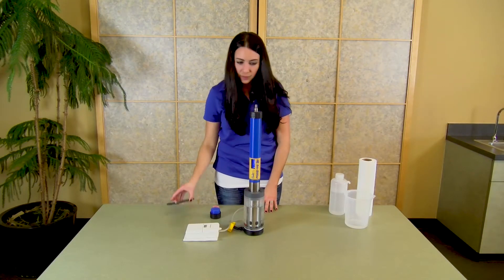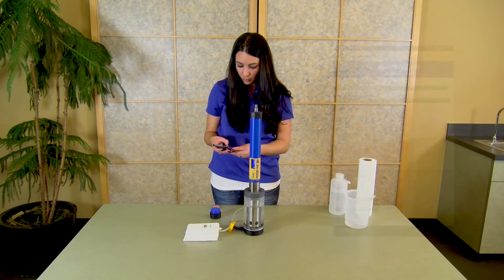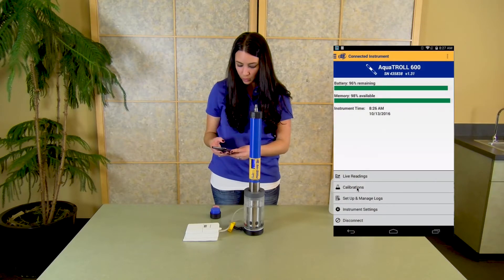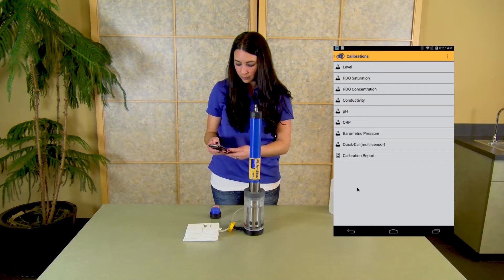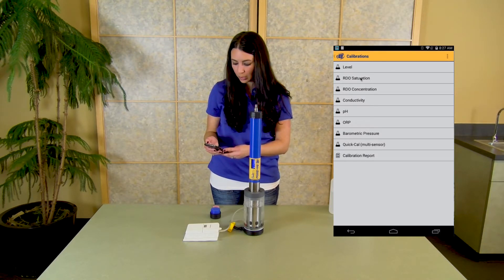Once you have the sensor set up, you will go into the app and connect the instrument. From the connected instrument screen, you will click on calibrations, then RDO saturation, and from here you can pick a one-point or a two-point calibration.